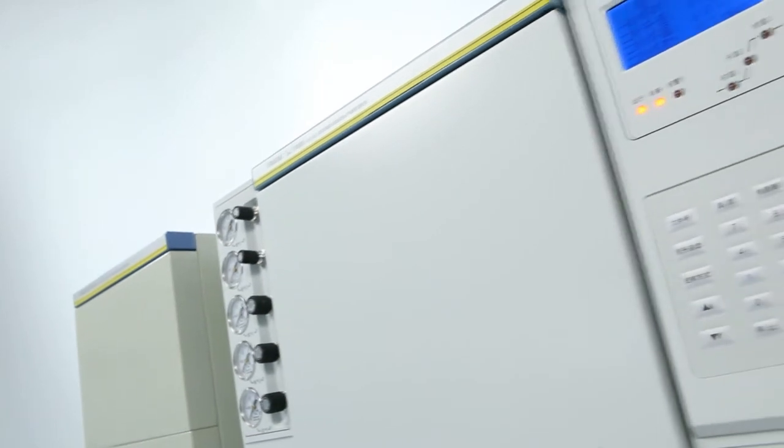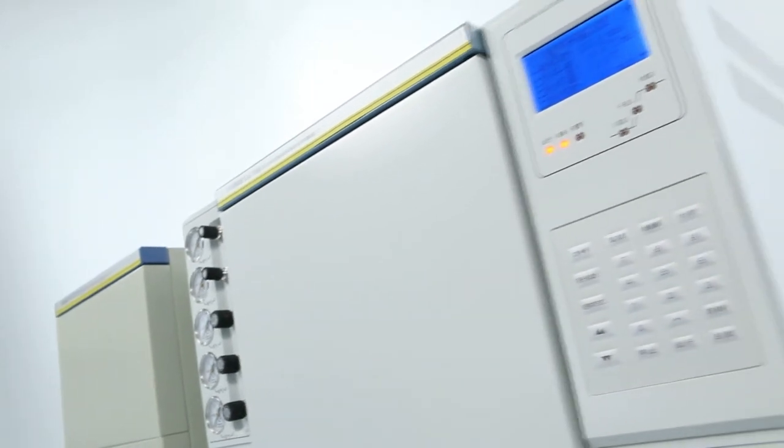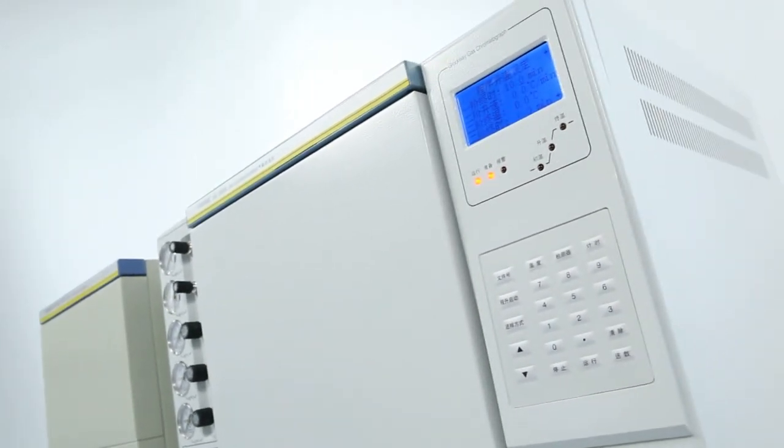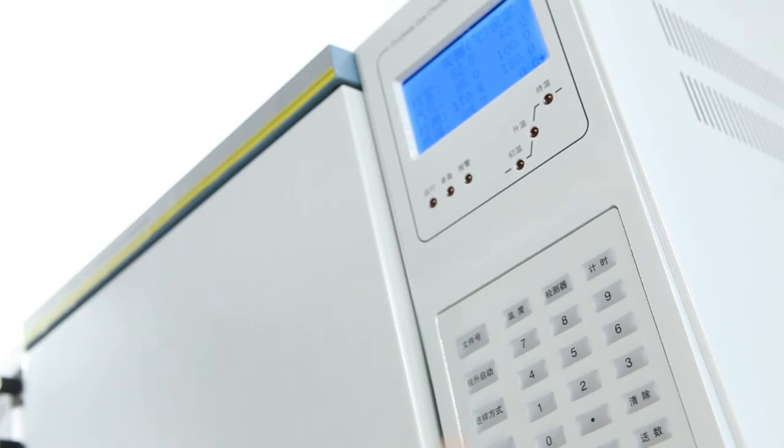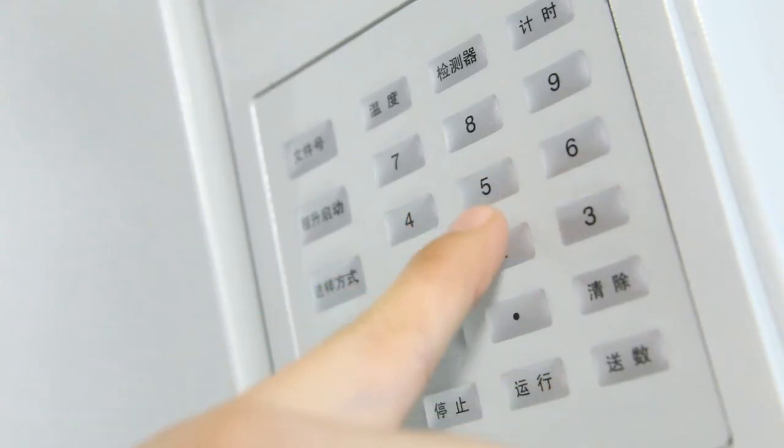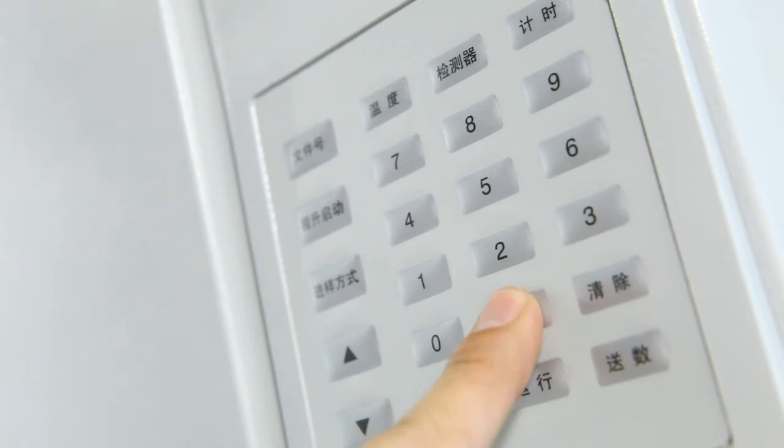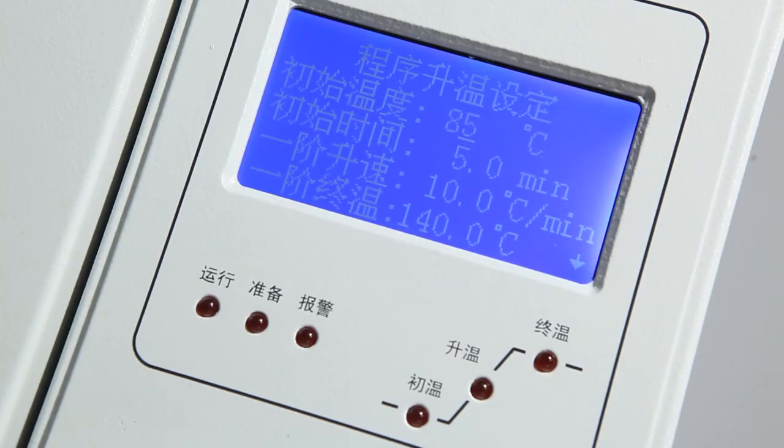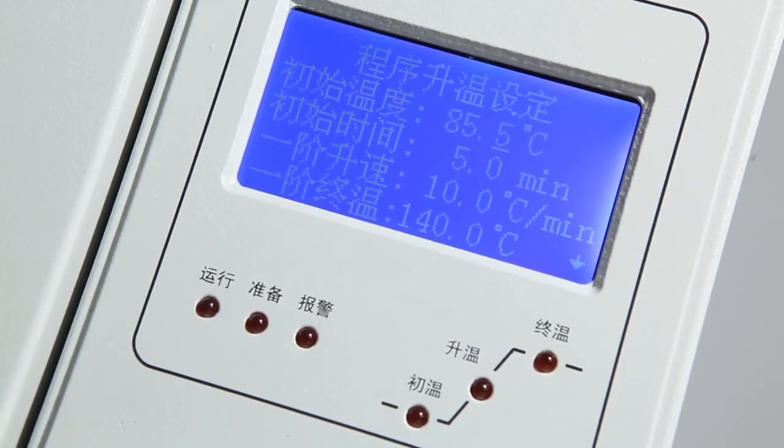The GC7800 adopts isothermal and multi-steps temperature program analyzing methods which can greatly improve the sample analyzing accuracy, the testing efficiency and the operational convenience.